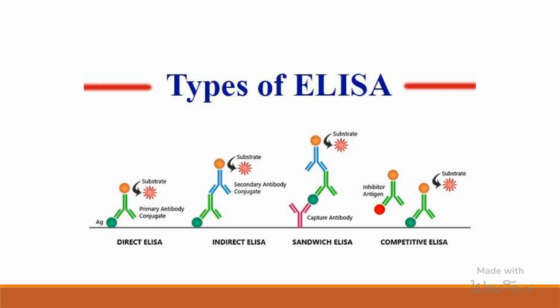These figures show the types of ELISA mentioned before. Notice the differences in structures for different types of ELISA.